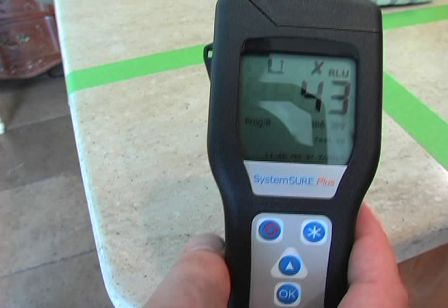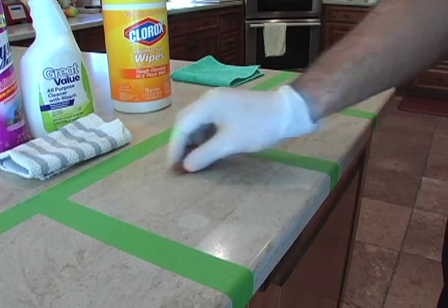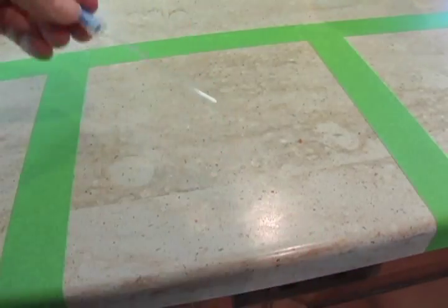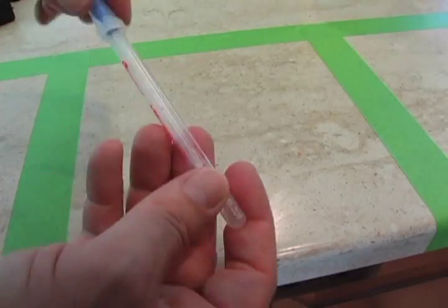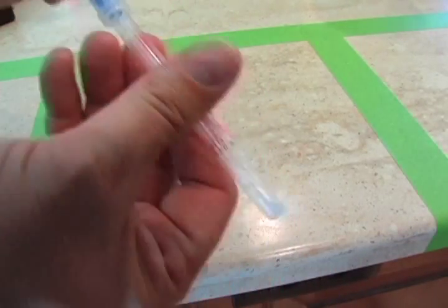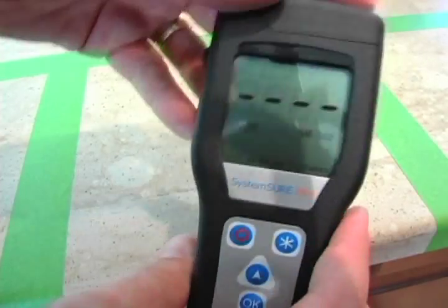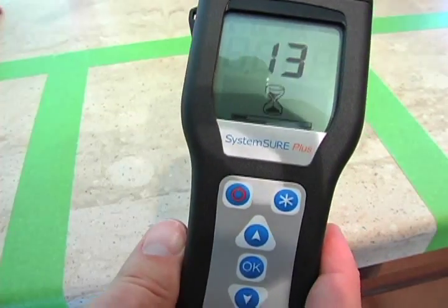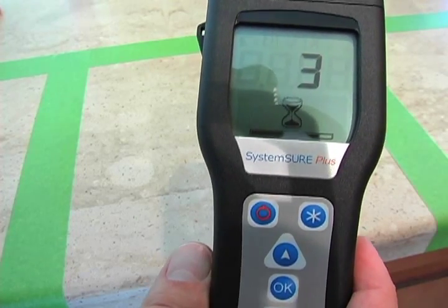Our second contestant is a disinfectant spray with a cotton cloth. We repeat the testing process after creating the biofilm by swabbing the area with the swab, placing it back into the tube, squeezing the solution in, shaking it around, placing it into the tester, and waiting 15 seconds for the test to run. We get a pre-cleaning reading of 129.